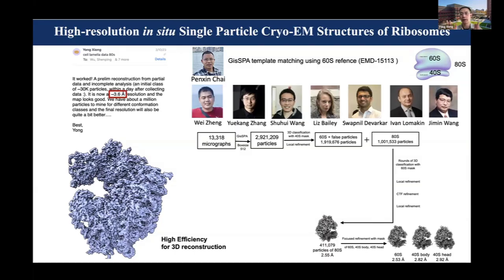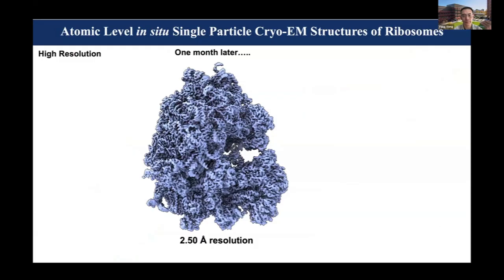Then in the final reconstruction, if it comes back, we know it's correct. Also, all of our searches started at 8 angstrom resolution. If we get to much higher resolution, and it makes sense, that as RNA should look like, protein should look like, we know it's not biased. So in this way, we can get the bona fide 60S particles to quite high resolution.